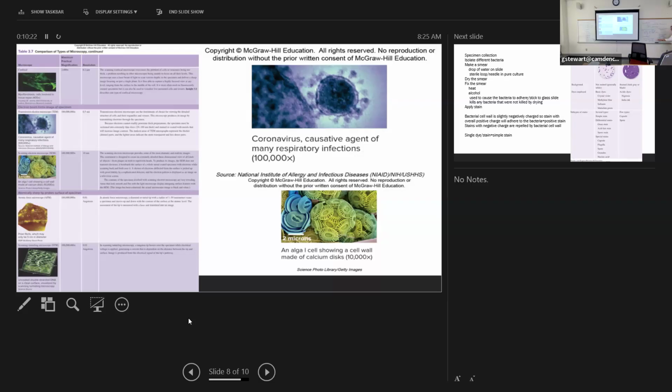But with the scanning, it's like it sounds, we're looking at the surface of the specimen. We're not looking inside like we did with the transmission, because we're literally slicing it open and looking inside. So every picture that you've seen of a taste bud, for example, or maybe a hair follicle, a lot of those are scanning electron micrographs because they're showing you how all the pieces fit together on the surface.